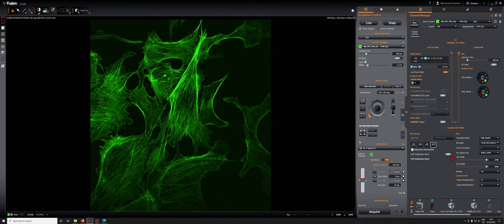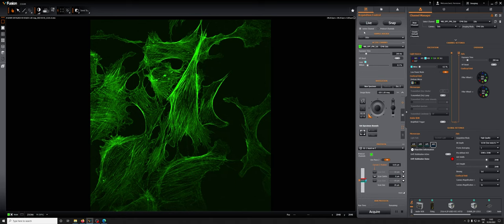What I have on right now as a sample is something stained with Falloyden and we're looking at it with the Zyla camera. That's the camera with the smaller pixels with a 63x oil objective.